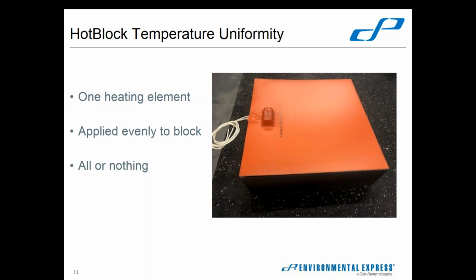It is possible that your heater mat can begin to fail at some point in its life. It's got wires in there to heat, and as with all electronic items, it will eventually fail. But what that means is that it will just take longer to get to a temperature, or it may not ever be able to reach it.